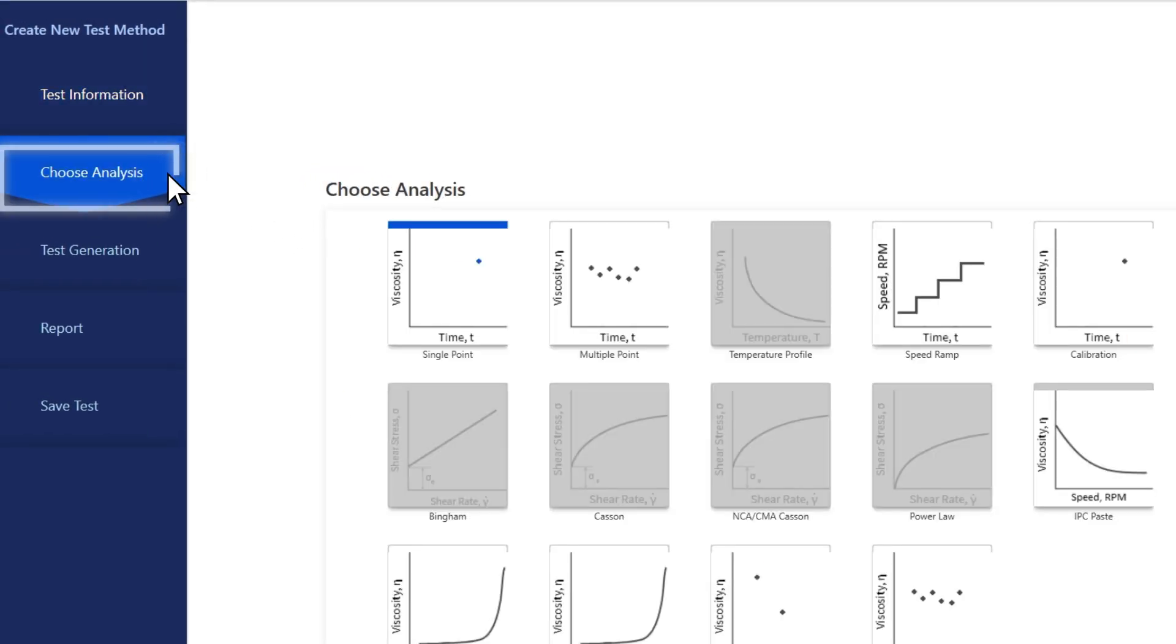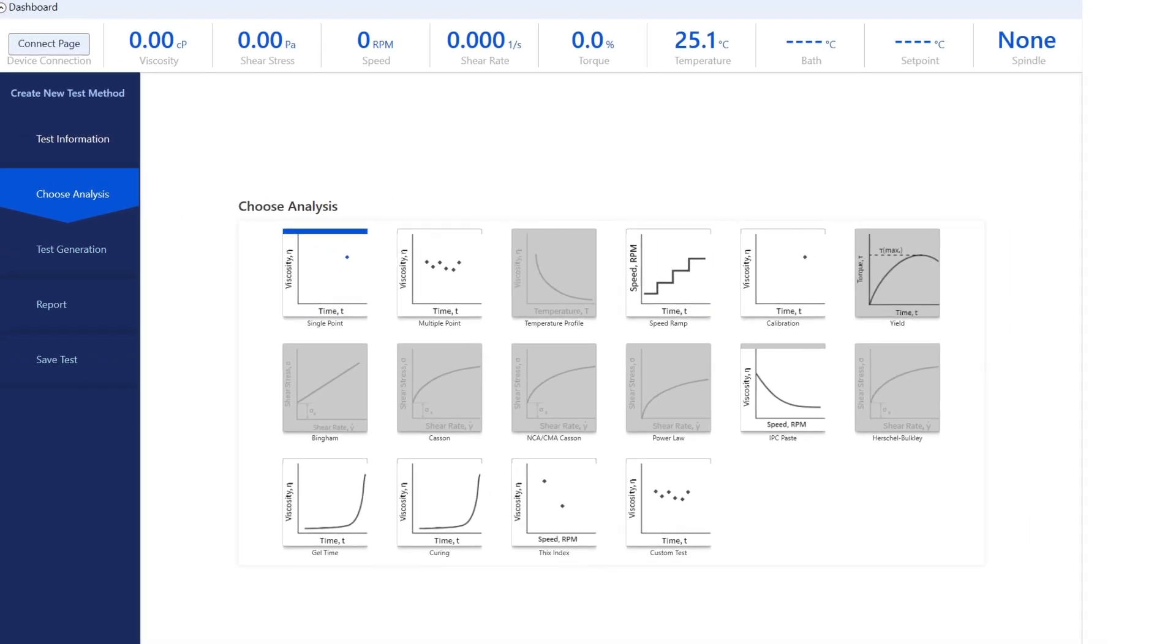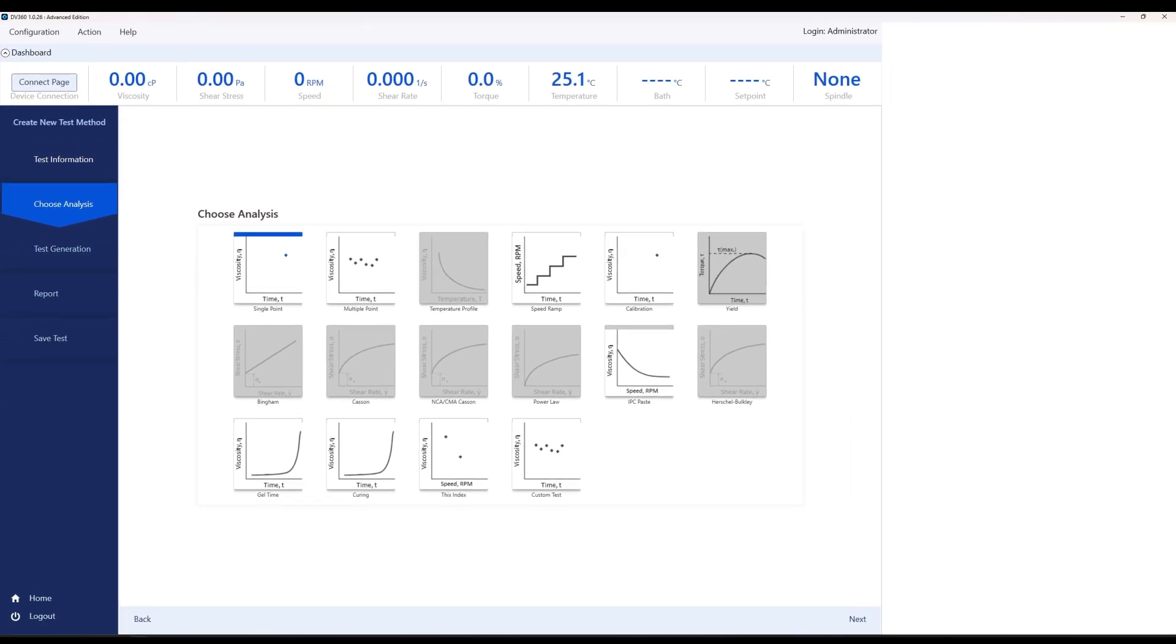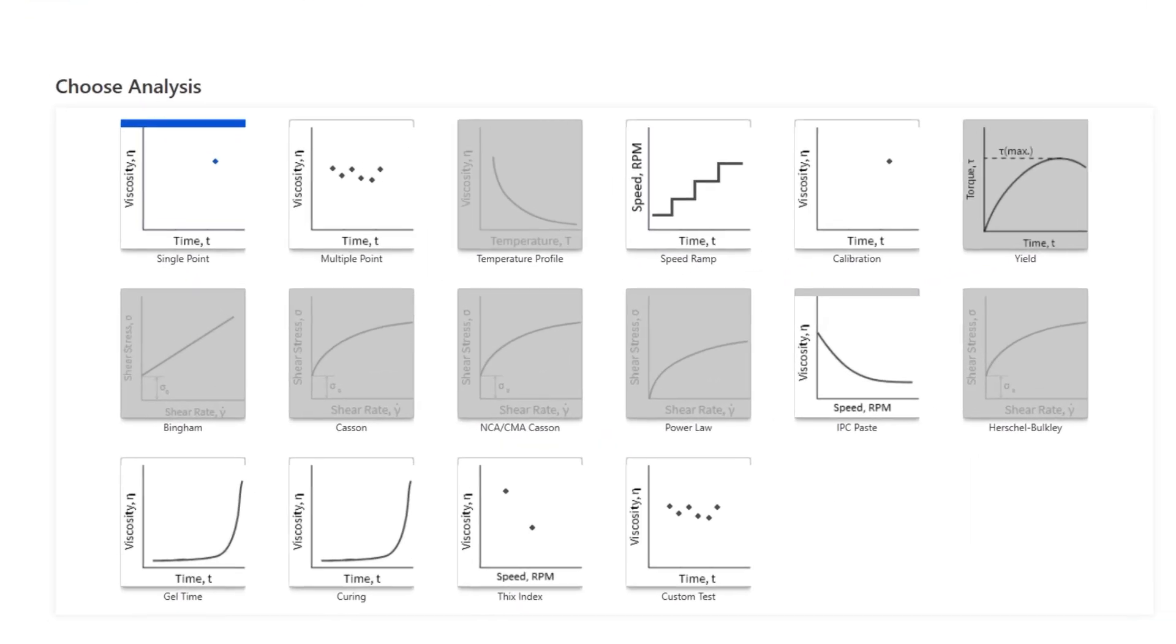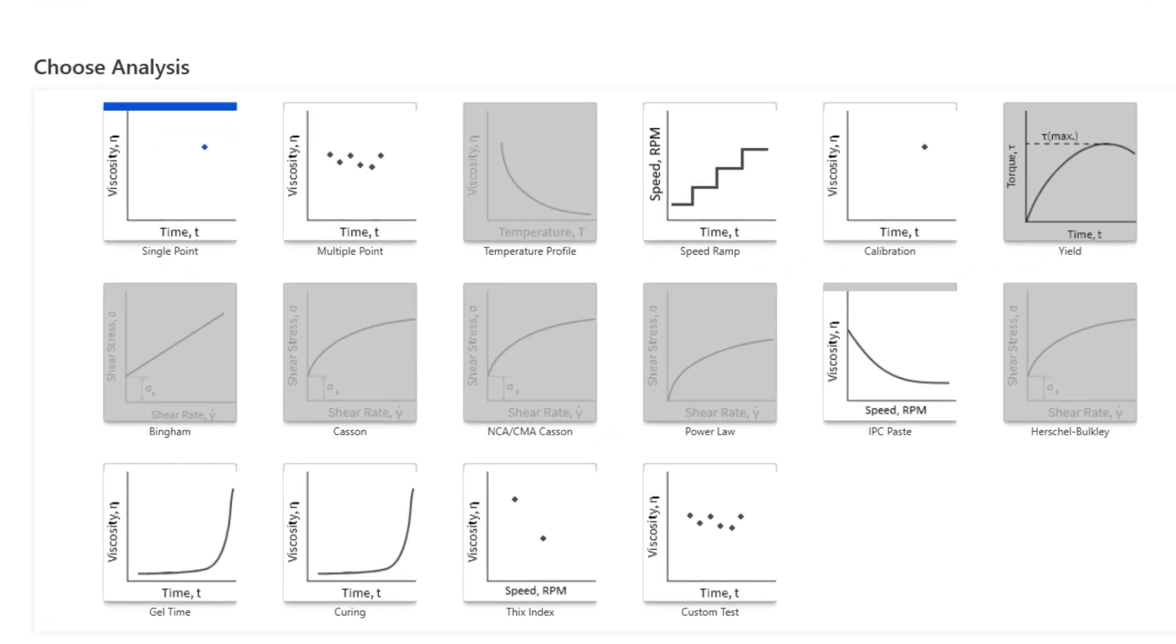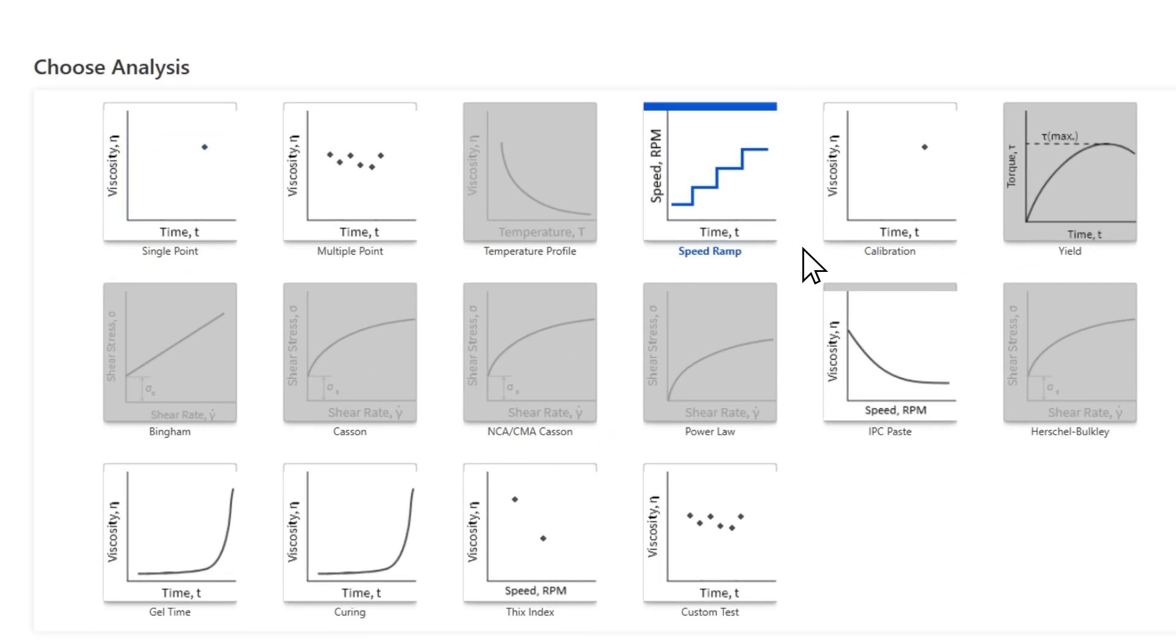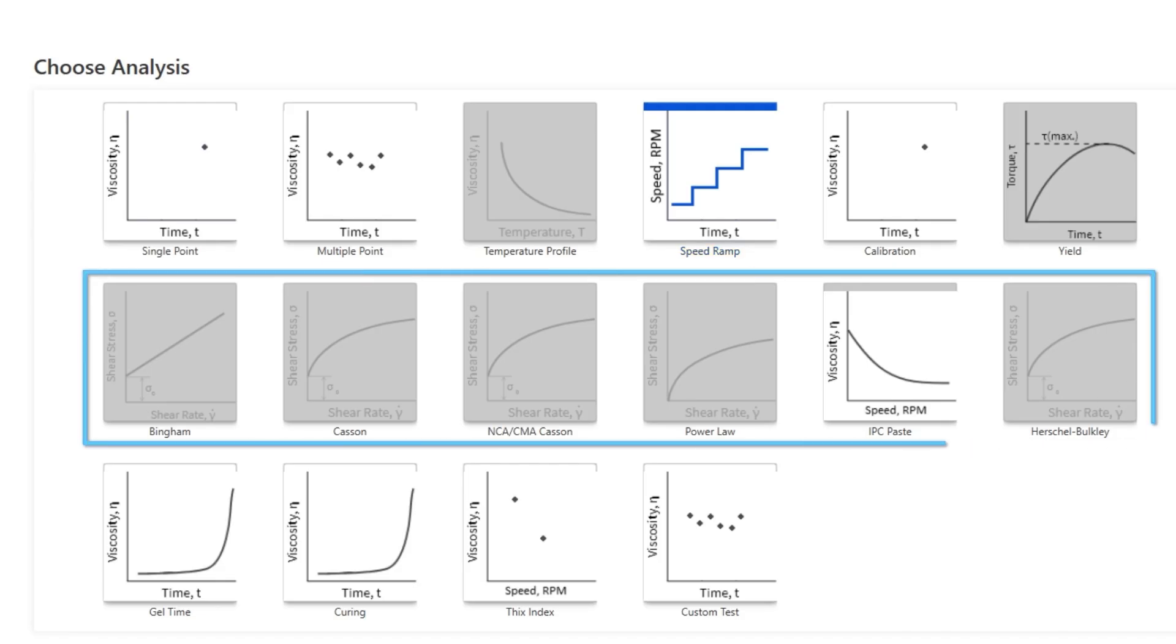The analysis options depend on which spindle you're using. Since we're using a standard spindle with no defined shear rate, we're limited to these options. Let's run a speed ramp to get a simple flow curve. If we're using a spindle with a defined shear rate, we will also have the option to analyze using one of the math models.